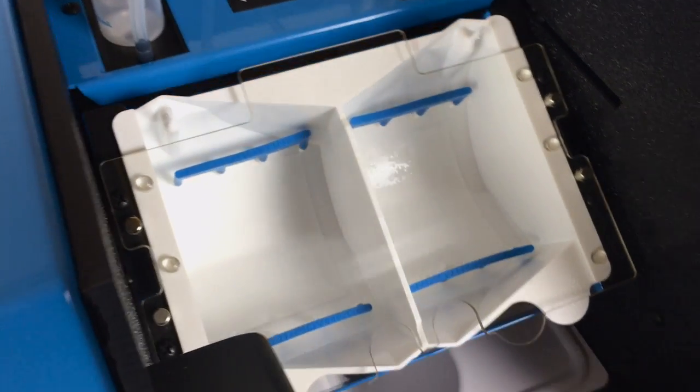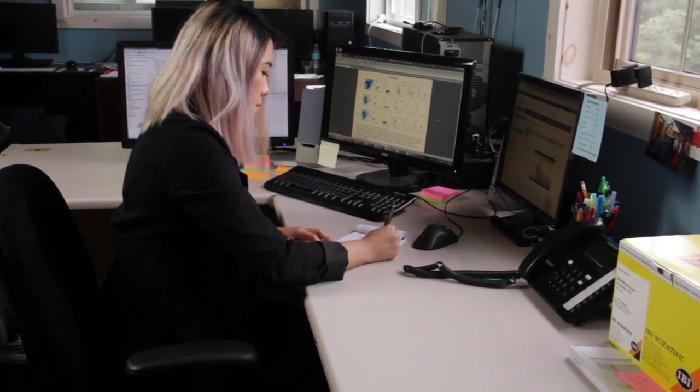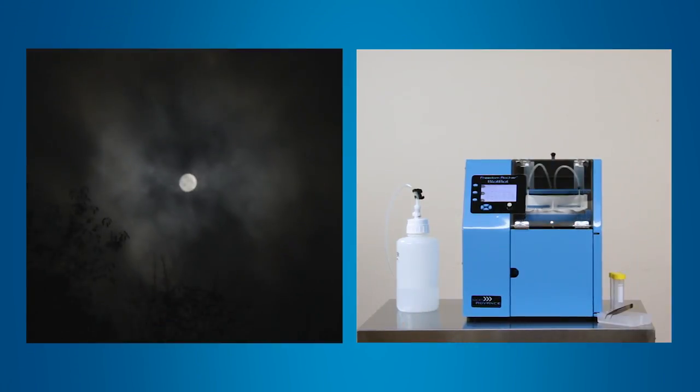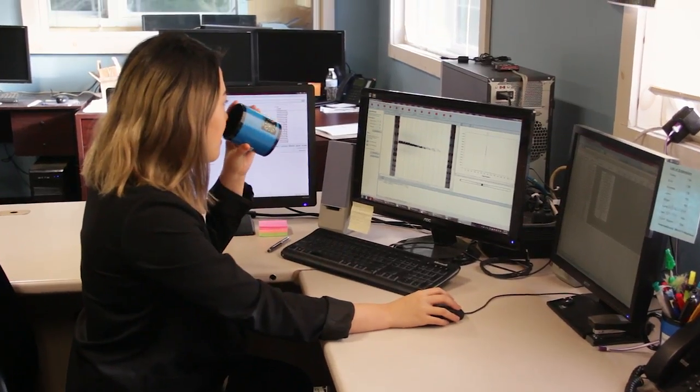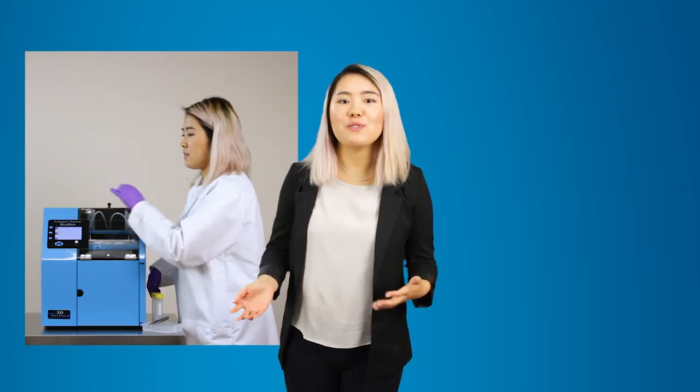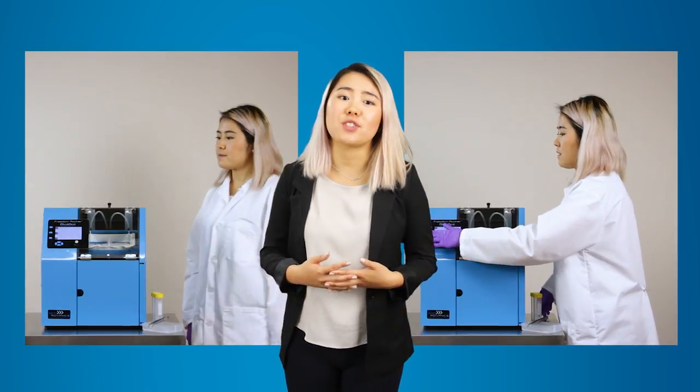The BlotBot also allows you to process gels and blots when you would otherwise not be able to, such as during meetings or overnight. Your blots will be ready for analysis when you arrive at your lab in the morning. You can get two full experiments done per day instead of just one.